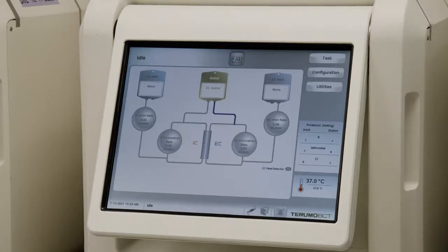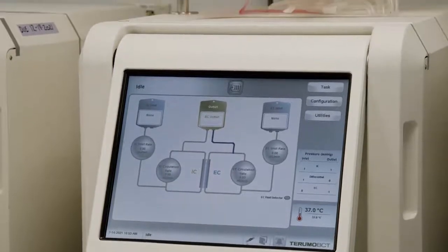Here we have loaded a set onto the system. There are several accessory bags and kits to connect to these lines, and the set comes pre-assembled with a waste bag and a harvest bag.